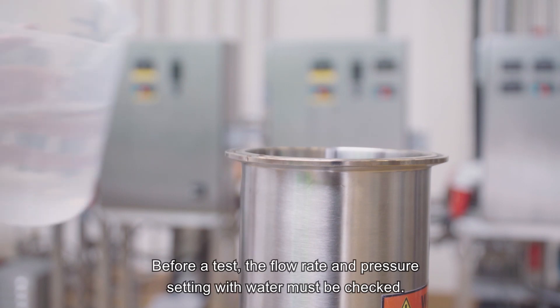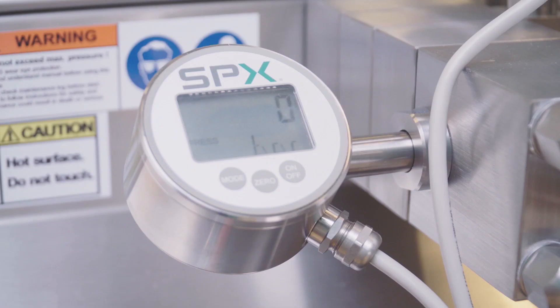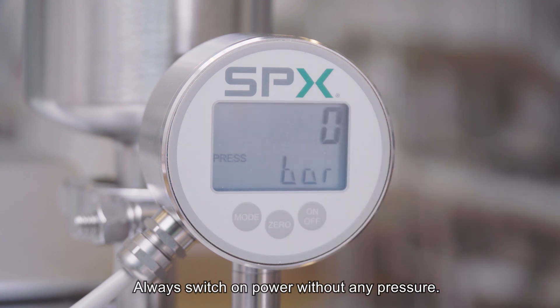Before a test, the flow rate and pressure setting with water must be checked. Switch on pressure gauges. Always switch on power without any pressure.